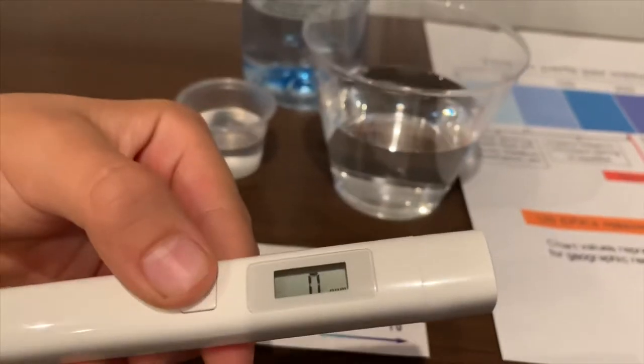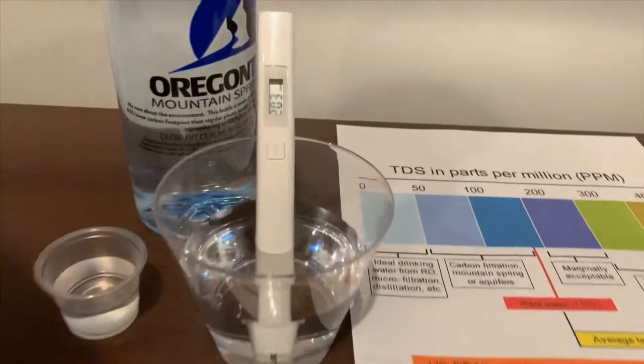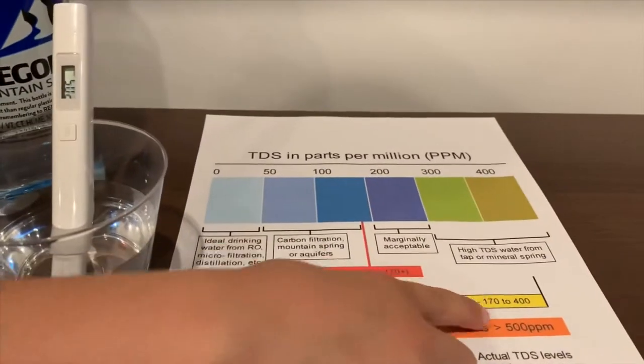Turn on the TDS tester, make sure it says 0, and it reads 204. That is average tap water.